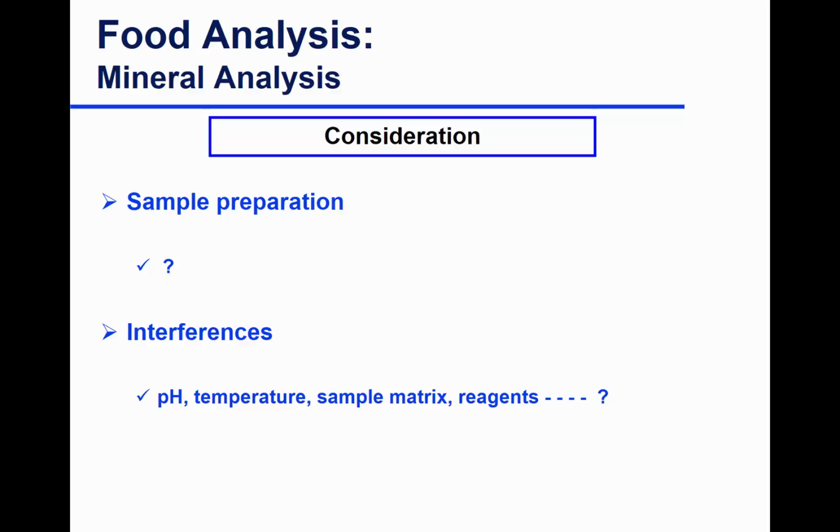What precautions do we need to take while preparing samples? A very important precaution for minerals. Yes, Bailey. That is true. If we're doing AA or ICP and we require ashing, yes, volatilization. Other than that, another important characteristic that we want to be careful about is contamination.